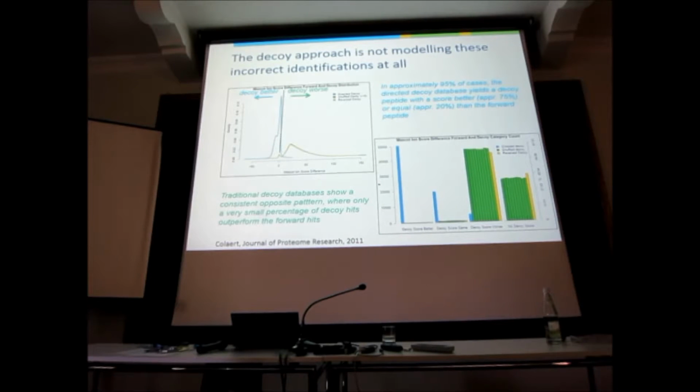This is a distribution of the ion score difference. I'm using Mascot, but Tandem gives you exactly the same. The ion score difference. So I take the spectrum, I take the original peptide hit, which I know is 90, 95, 99% right, and I calculate the score, and then I take the score of the best decoy hit. Now, if you look at the traditional shuffled or reverse databases, the decoy is nearly always worse than the original hit, okay? Except for this very small amount, which is our 1% FDR, okay? This is the 1% where the decoy actually gets a better hit.